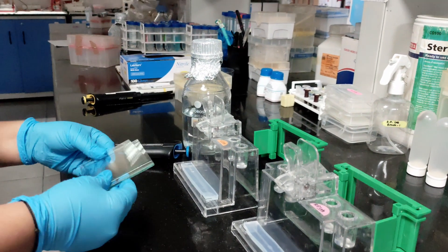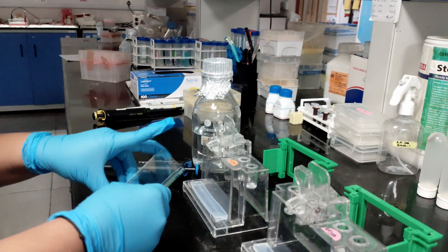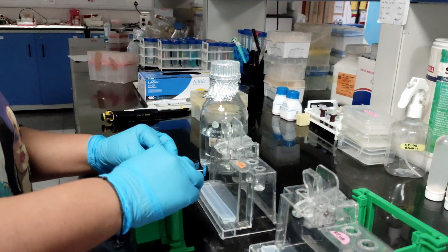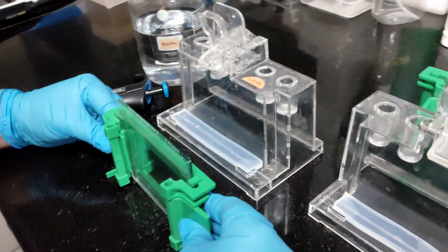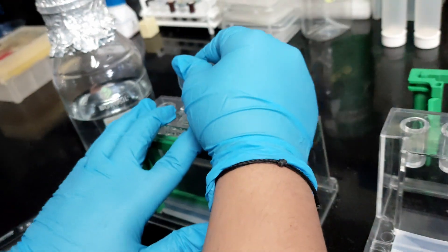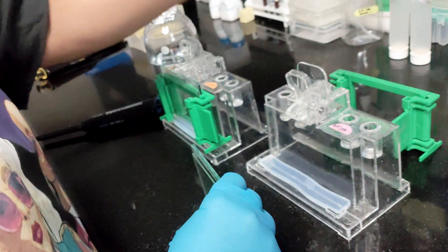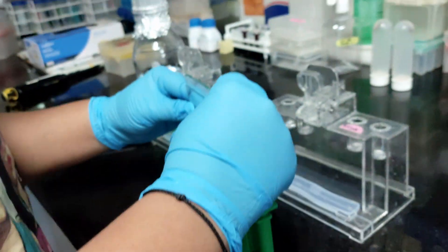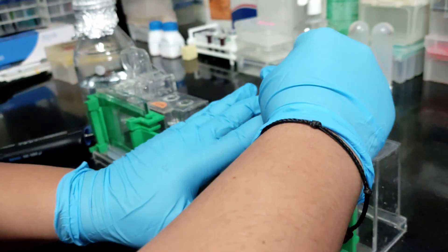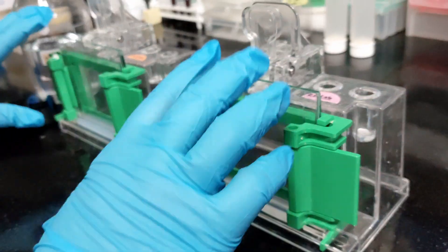We need two different types of plate — one is a thin plate and the other is a thick plate. We have to arrange these plates in this green stand. We'll fix the plates inside and close the clamps very tightly, then place them in the caster inside the clip. I'm going to repeat this process for the other one as well.